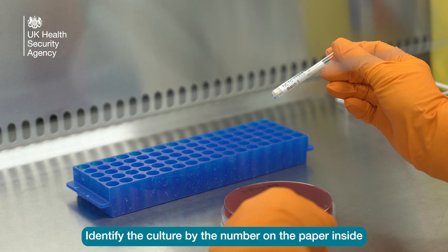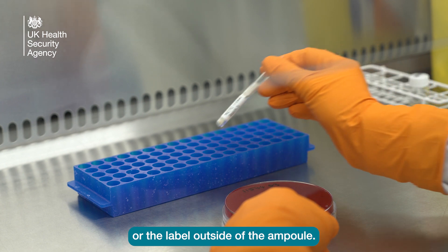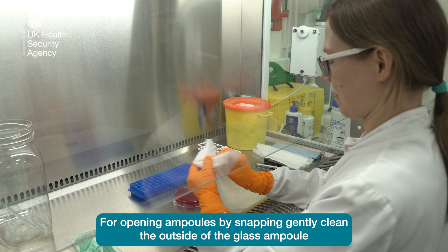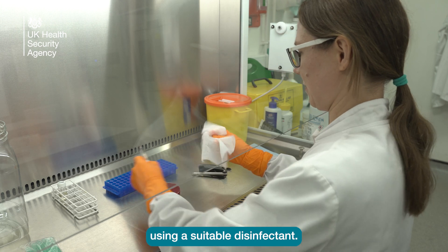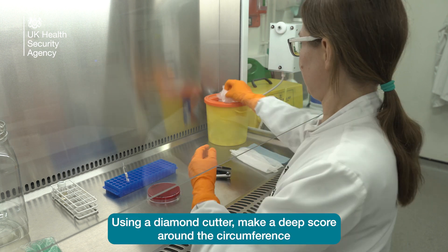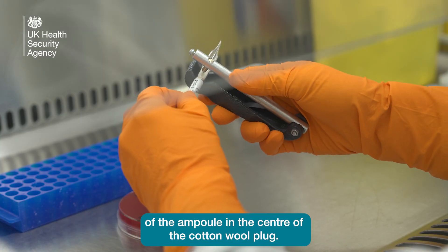Identify the culture by the number on the paper inside or the label outside of the ampoule. For opening ampoules by snapping, gently clean the outside of the glass ampoule using a suitable disinfectant. Using a diamond cutter, make a deep score around the circumference of the ampoule in the centre of the cotton wool plug.